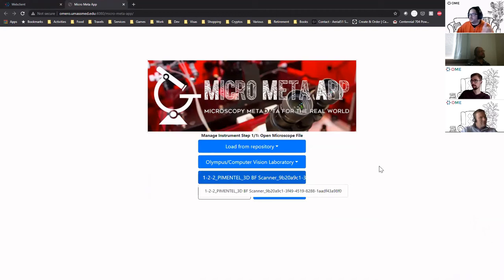From here, obviously, we want to expand more and go to a point where you can actually have maybe a picture of the microscope we generated in the previous canvas in the OME server as an image, so that they are browsable, and then being able to connect them directly to the image in OME. And obviously, the next step here is being able to do the same procedure that we're doing in the standalone version, retrieving the metadata from the image, doing the same procedure on the OME server. So doing the bindings for retrieving those metadata from the image from the server.